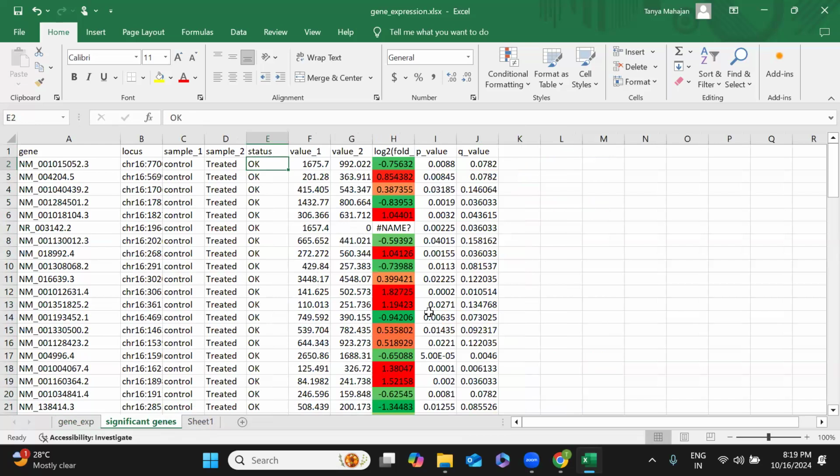For example, this is for the sample 1. If we compare with the sample 2 and sample 3 in the same file, in some cases the gene is 0 and in the other samples, maybe it has been expressed. So in that case, will we get the same results or different? Actually, when you are having a lot of samples, individually we are not dealing.